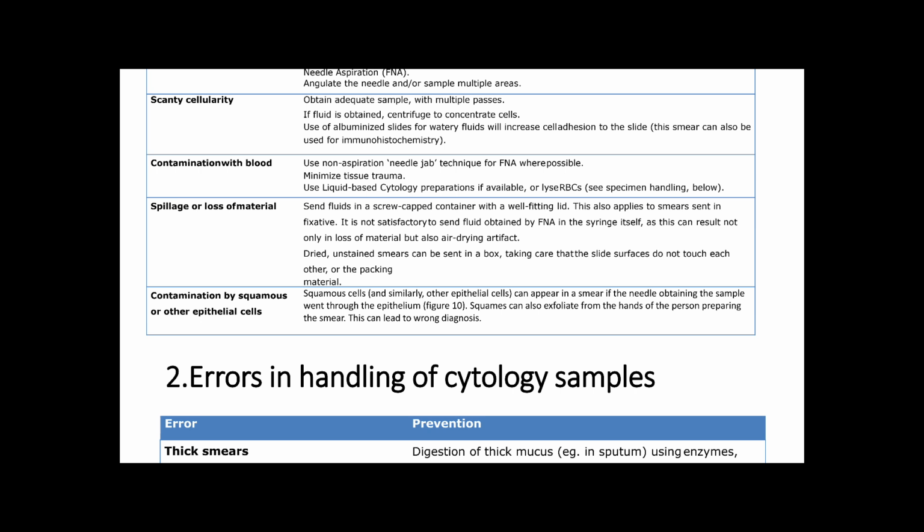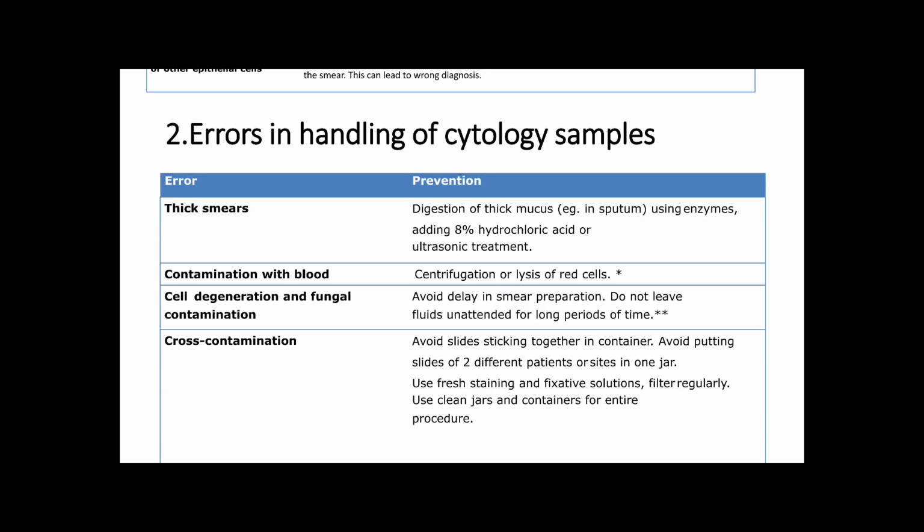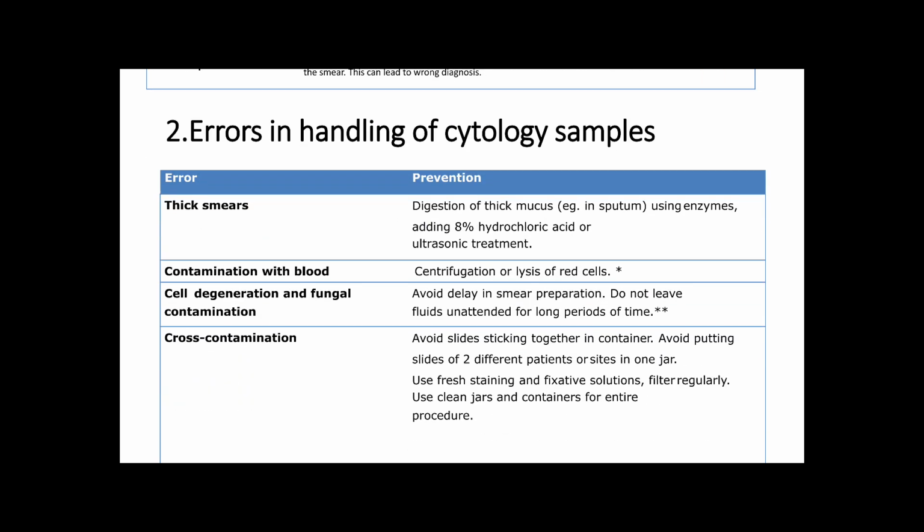So next, we consider the errors in handling of cytology samples. First, a thick smear. How to prevent: digestion of thick mucus.